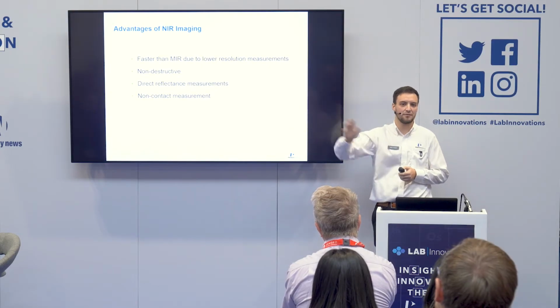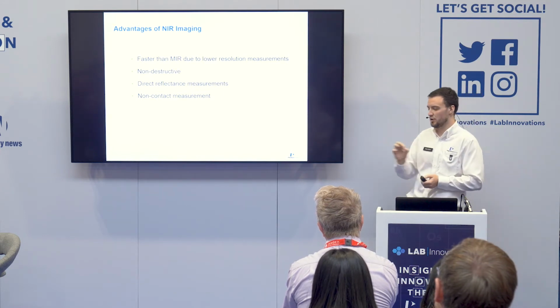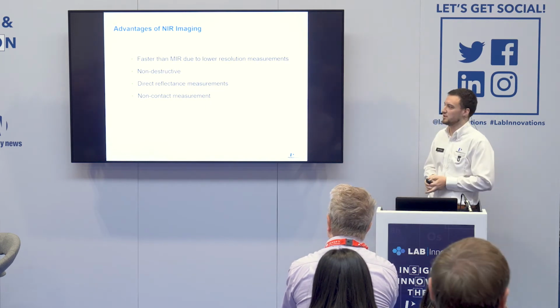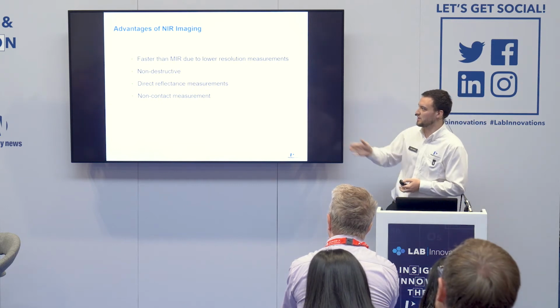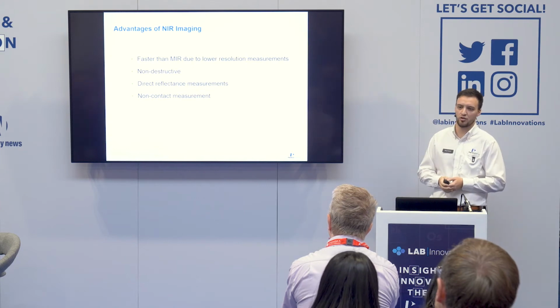If you compare near-infrared imaging versus chromatography, it's non-destructive. Once we put the sample on the microscope, we don't have to touch it, and you don't have to put it into any solution or anything like that, as you would if you're doing the analysis by chromatography. Near-infrared is really good for reflectance measurements, and as I mentioned, it's a non-contact measurement.